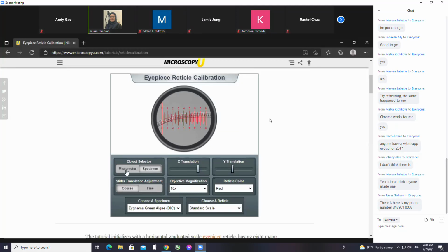Okay. So for the ocular ruler divisions, are we rating 32 or 8? 32, because there are 32 total lines, and so there are 32 total divisions. There are 8 units, but divisions in terms of those lines that we're seeing, there are a total of 32.